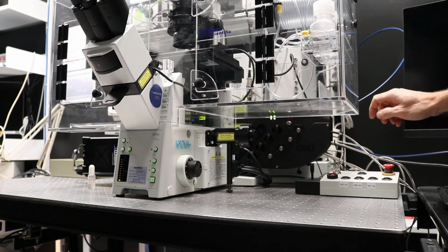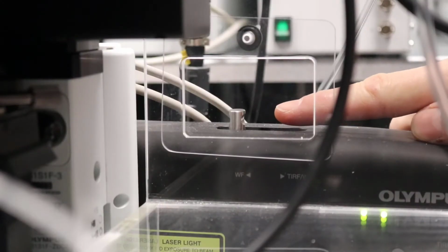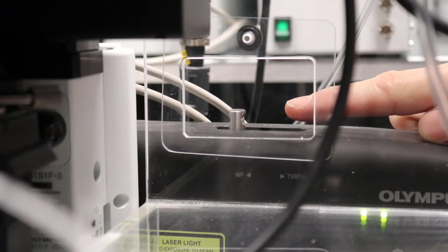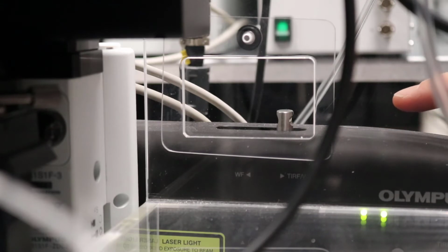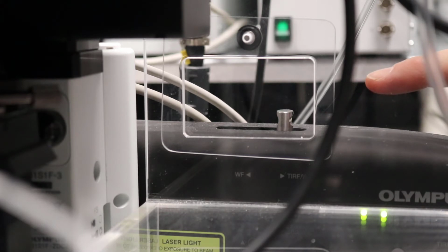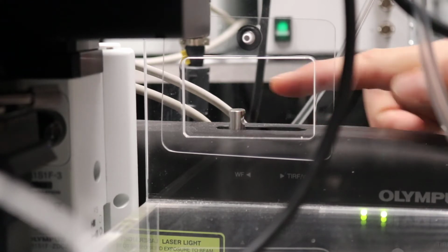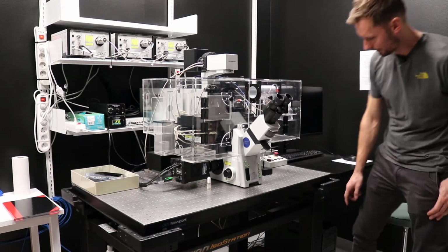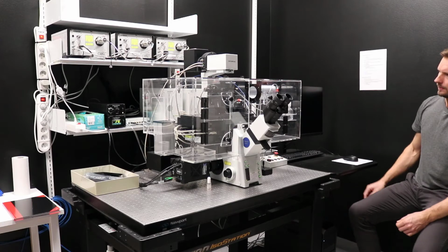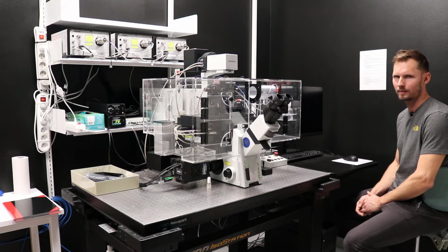What you need to know at the basic startup is that there's a switch back here. This one is currently in the wide field position. When you need to use TIRF, then you take it to the right, which is a position that is used for both TIRF and wide field, but it takes some light from the wide field, and if you're only using it for wide field, you should go to this position. After turning on all the hardware components, you can now turn on the computer. And now the software is able to control all the parts.